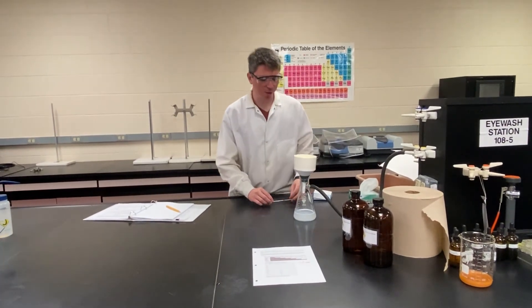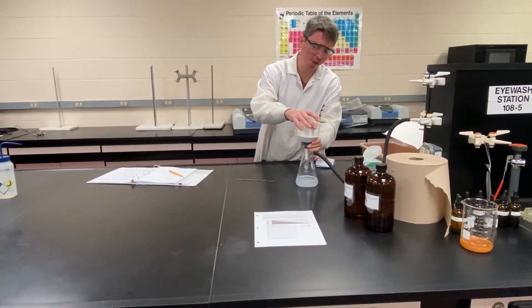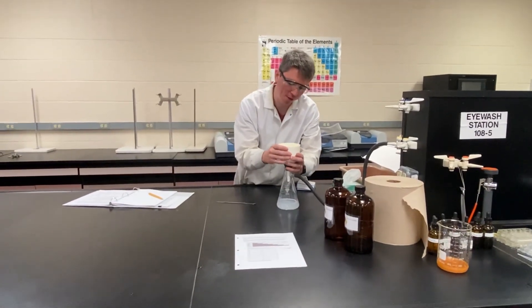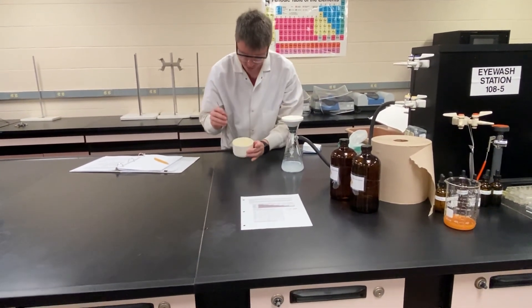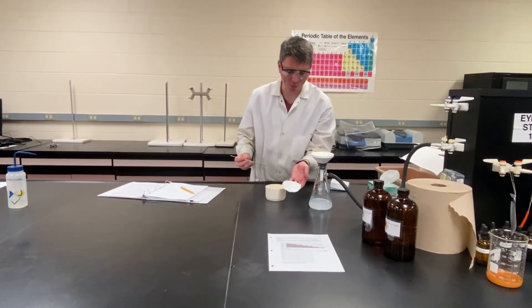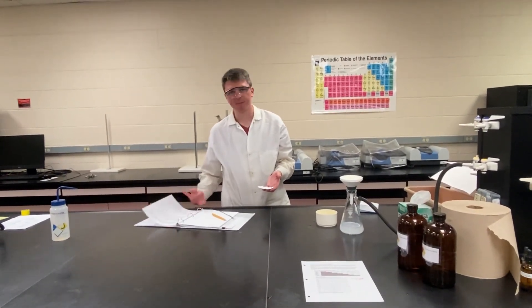Once our precipitate is dry, we're going to go ahead and get its mass. First thing we need to do is turn the vacuum off. Next thing we want to do is release that vacuum — sometimes it'll do it on its own and you can lift the funnel out; sometimes you may need to break that seal a little bit. A lot of these funnels are nice because the top half comes off as well. Take that off to really get to our precipitate, and try to just bend that paper up. Now that we've retrieved our precipitate, which should be fairly dry, we can go get its mass and then continue on with all of the stoichiometric calculations to get our percent yield.